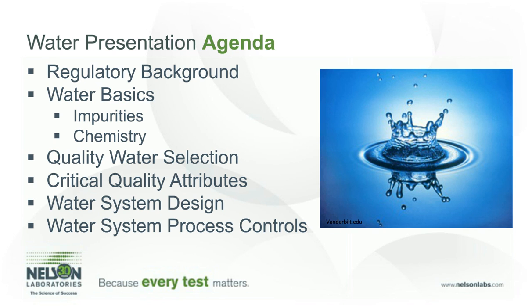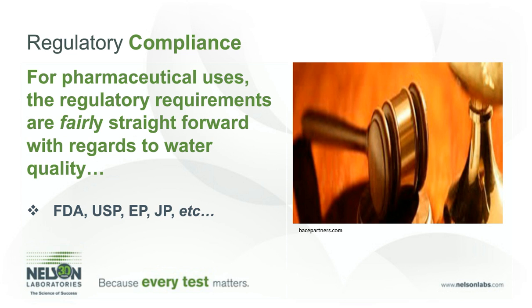So to dive in, we'll start with regulatory requirements. For pharmaceutical uses and purposes, the regulatory requirements are fairly straightforward with regards to water quality. We have the FDA, United States Pharmacopoeia, European Pharmacopoeia, Japanese Pharmacopoeia, as well, for example, providing regulatory requirements for water quality.